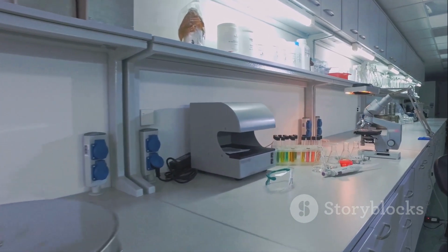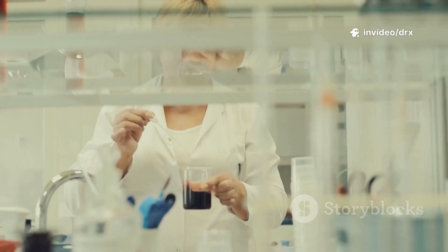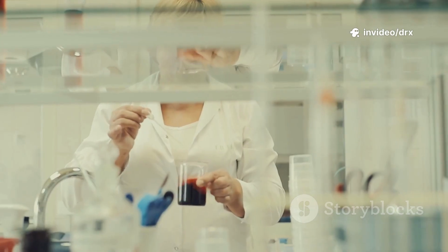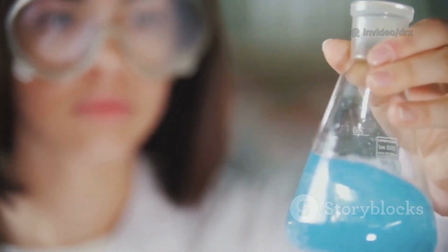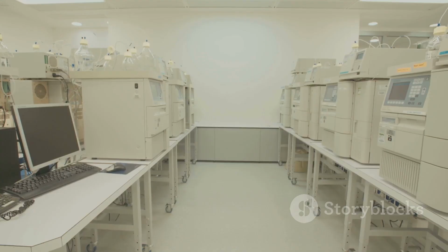Non-aqueous titration is a powerful method used in pharmaceutical quality control to accurately determine drugs that cannot be titrated in water. It gives sharp, reliable endpoints, making it essential for modern pharmaceutical analysis.